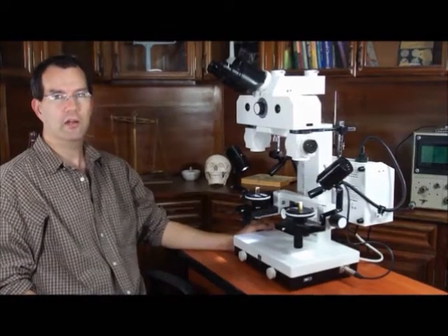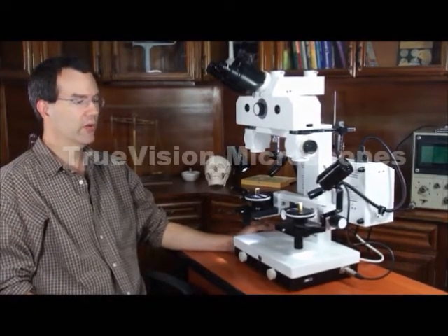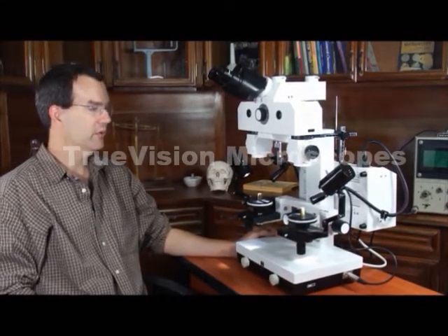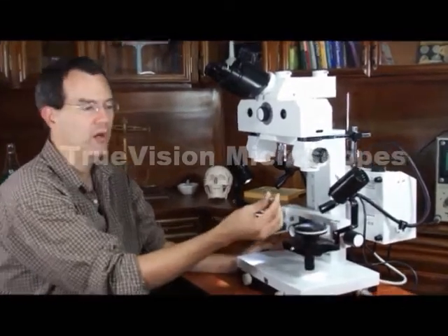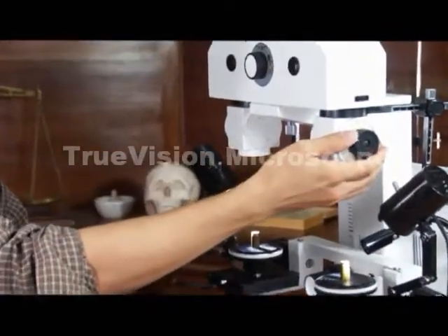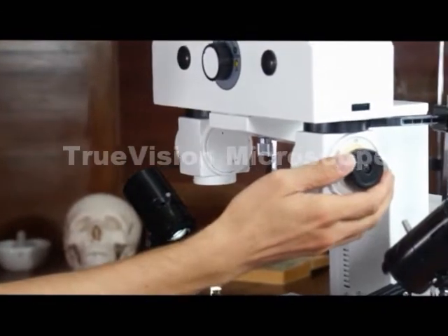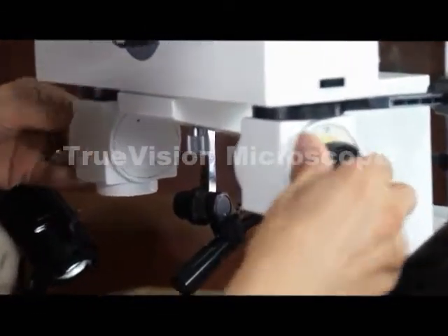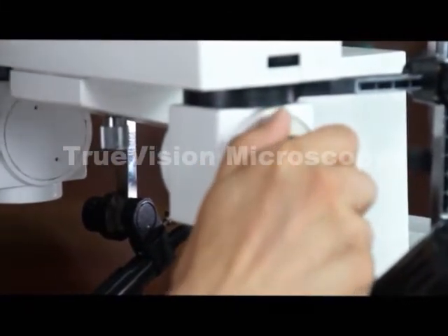Here we have a Forensic Comparison Microscope, also called a Bullet Comparison Microscope. It can be used for looking at bullets and cartridges. It's a low-power version, so any type of forensic evidence can be used for comparing whenever you're looking at using low-power objectives.